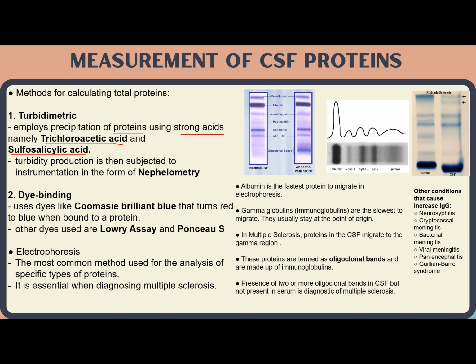Then we have dye binding. It uses dyes like Coomassie Brilliant Blue, or CBB, that turns from red to blue when bound to a protein. Other dyes used are the Lowry assay and Ponceau S.